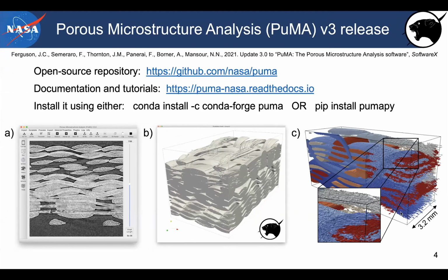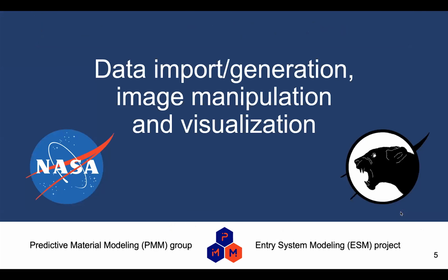If there are no questions and everybody is following, I'll jump into the data import, generation, image manipulation, and visualization inside pumapy.